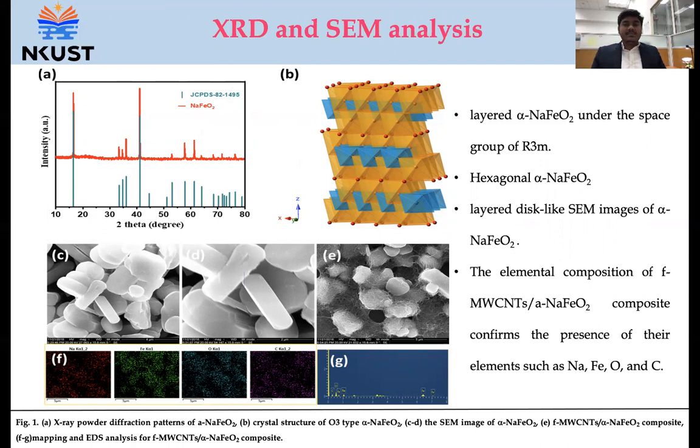Figure E shows the combination of functionalized multi-walled carbon nanotubes and alpha-phase sodium ferrite. The EDX elemental analysis confirms the presence of sodium, iron, oxygen, and carbon, confirming that the composite formation was successful.